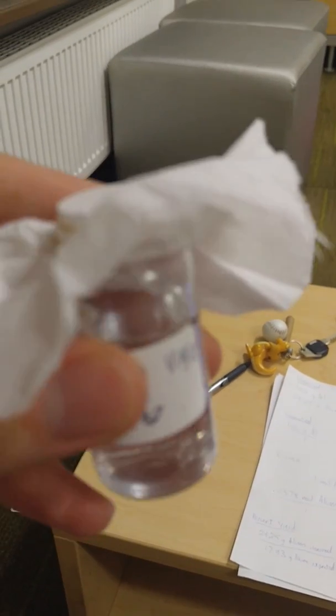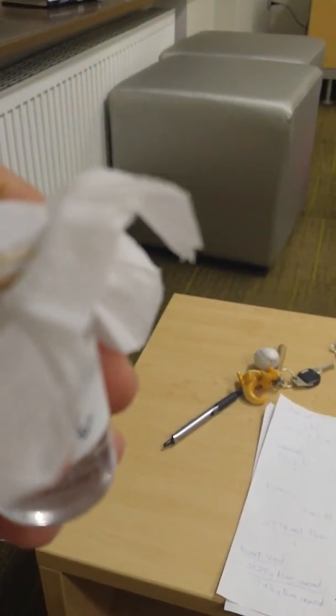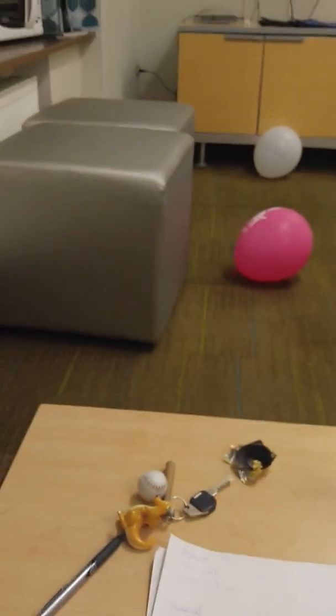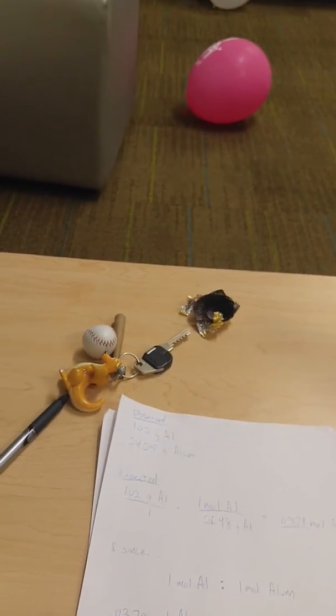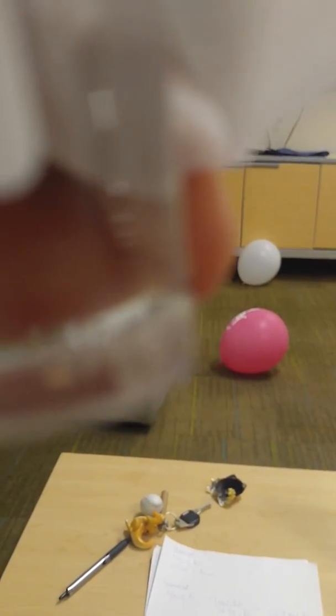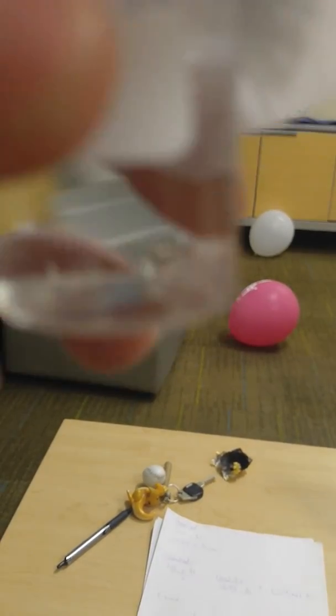A way we could have potentially avoided such a high percentage yield would be to have dried the alum sample we had before we dissolved it again. That would have gotten rid of a lot of the water that was stuck in between it from all the washing, which would have made a smaller reading in terms of the mass, making it more accurate in terms of alum, since a lot of the water molecules would have been dried off of it.